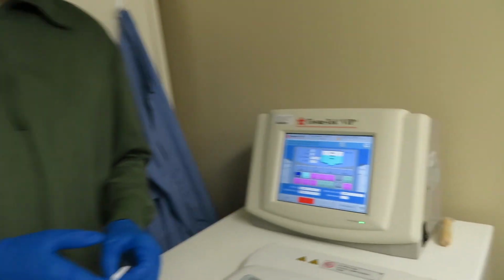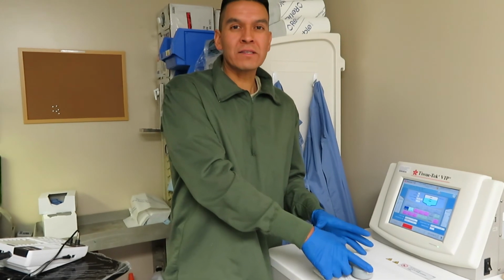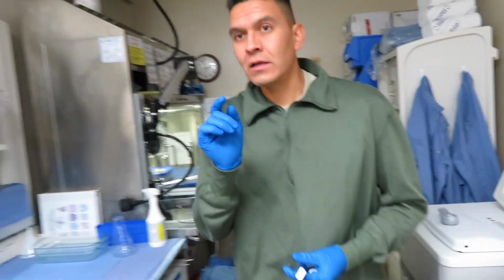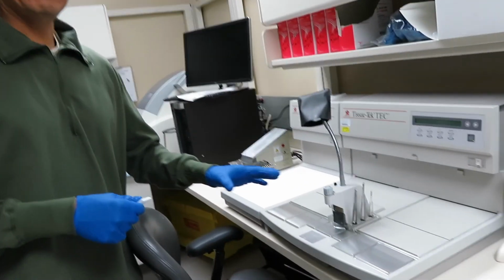Anyways, I guess I better not open that. So that's what we do. So it goes through this processor overnight, all these tissue cassettes. Then in the morning, the techs come take them out and they bring it over to this embedder.